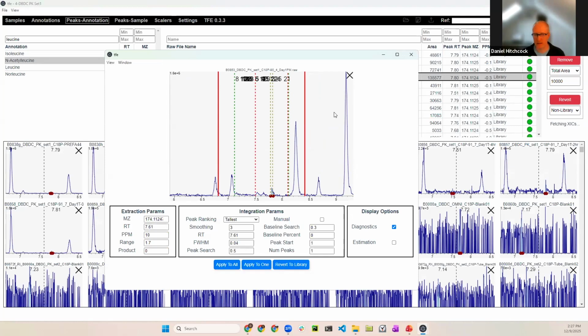But it will only take 30 seconds as opposed to 10 minutes, which is what it'll take to actually re-extract everything. And this is 2,400 megabyte raw files run on a C18 positive method. And that'll end the demonstration unless we just want to watch it be slow.